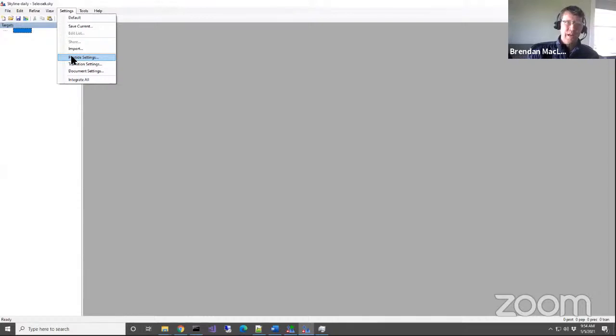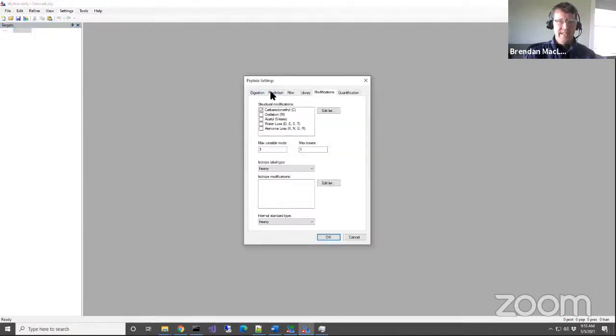There are a number of steps I'm going to have to do to weave my way around some issues that we're going to fix in Skyline. And that's one of the huge benefits of teaching Skyline so much: it's a very high bar to create software that's easily teachable. So every time we go out and teach it, we find new things that we should make easier and better.